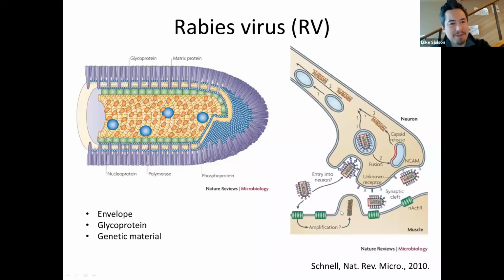So one quick other warning, I'm sorry to interject this. One thing that is relevant is if you have a genomic Cre-dependent locus and you inject a Cre-dependent AAV, it will inhibit expression of that locus. So if you have, for example, a Cre-dependent channelrhodopsin mouse, and then you inject a Cre-dependent GFP virus, it will inhibit expression of the genomic channelrhodopsin, if the lox sites in the AAV backbone are compatible with the lox sites in the genome, and that's been shown many times. So that's something that's a mistake people make a lot.